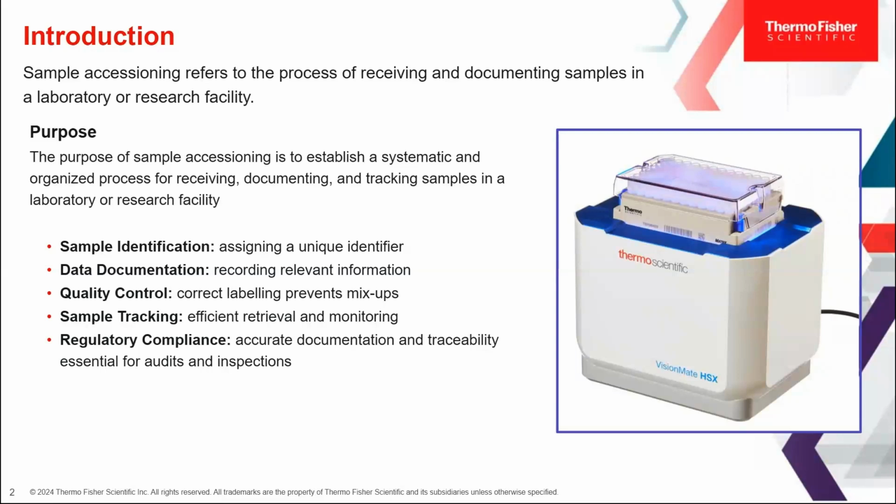So proper sample accessioning practices support compliance with regulatory requirements, such as good laboratory practices or GLP, good manufacturing practices like GMP as well, and accreditation standards as well. So accurate documentation and traceability are crucial for audits, for inspections, and for demonstrating compliance with quality standards.